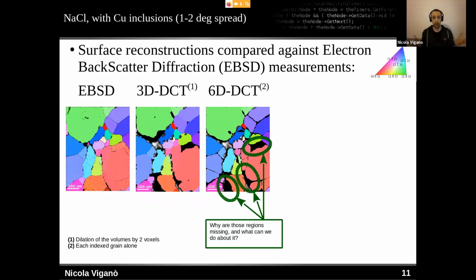So this is a quick example. In this case, we had a slightly deformed material. So it was very little, actually, the local misorientation that we had in the grains. But actually, we see here that there were gaps in this grain map because we couldn't index some of the grains throughout the process, due to overlap and neighboring grains and so on.